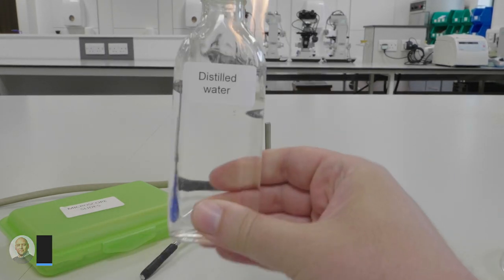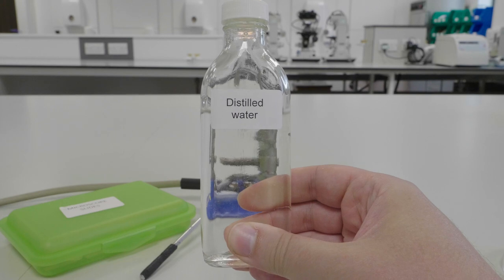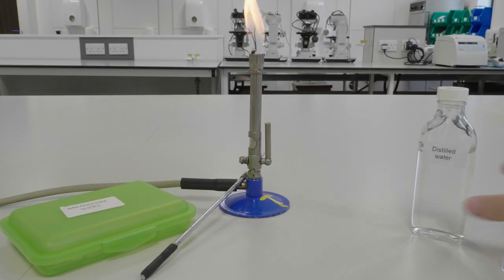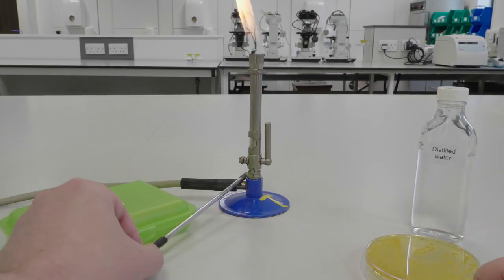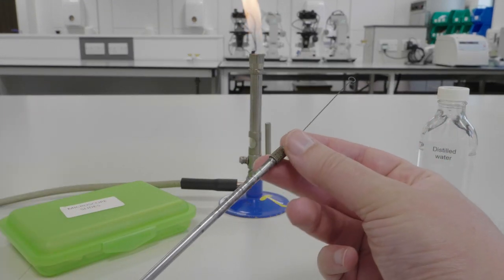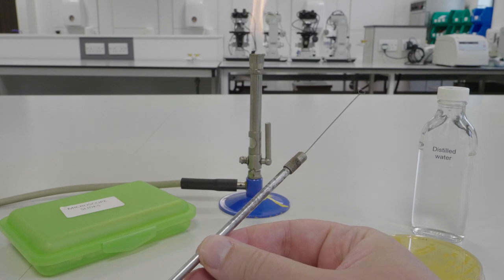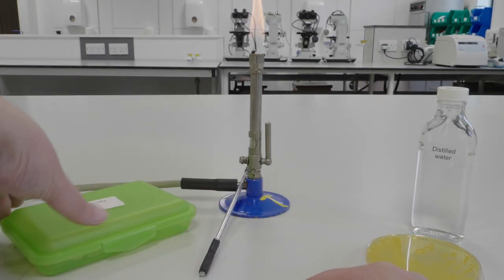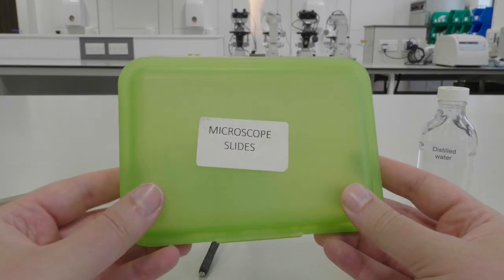For this method you will need a bacterial culture, some distilled water which can be found in the box by the sink, an inoculating loop with the wire straightened by running between your thumb and forefinger, and a box of microscope slides.